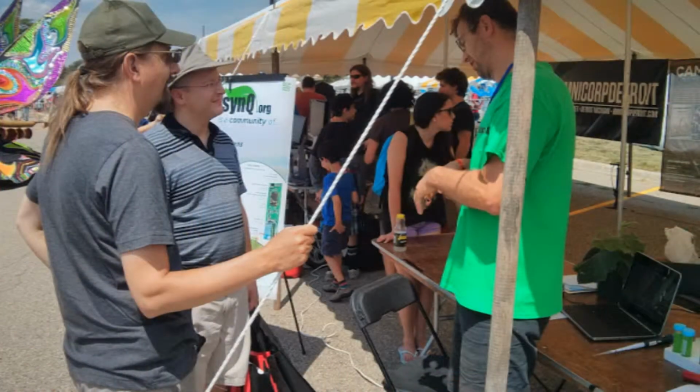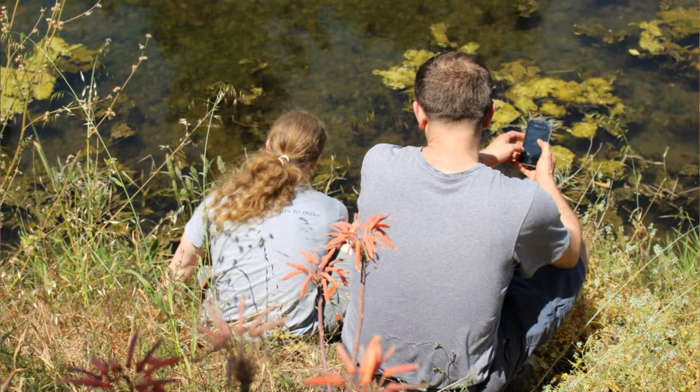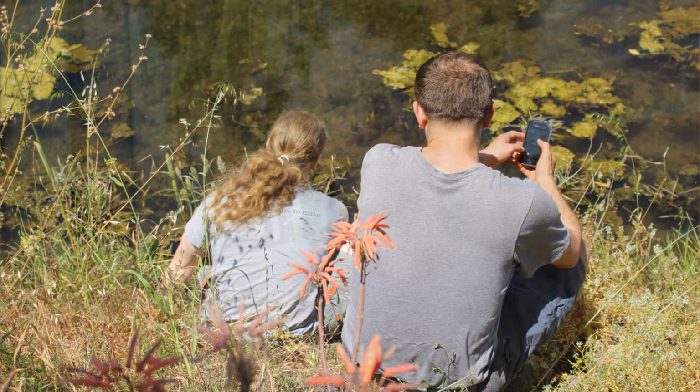So that's one application. For educators, if you're teaching plant science or plant biology, the big push in education now is project-based learning, and then connecting learning to actual meaningful outcomes. And that's exactly what this project, the Photosynq, is. It's all project-based, and it connects to real-world outcomes. You could have students taking data for a real scientific project, which may even produce a paper or something of interest, in real time, with feedback from all the other users.